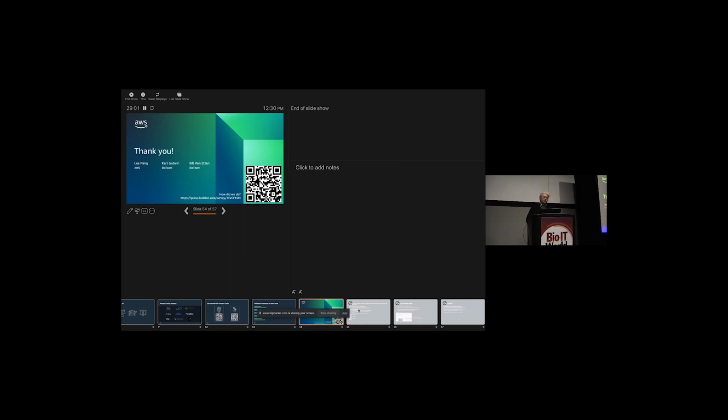Right now, for all workflows, for a workflow run, we recognize that there are efficiencies to be had by having a shared file system across all tasks. So that's part of the starting workflow process.